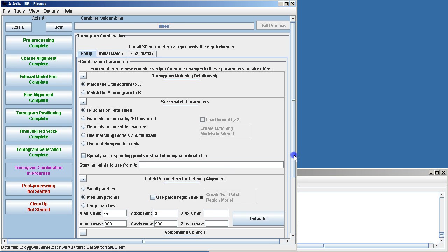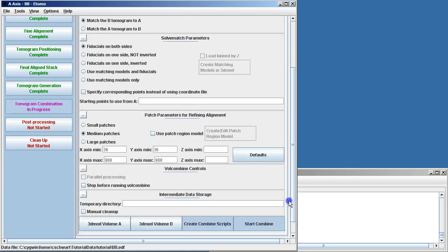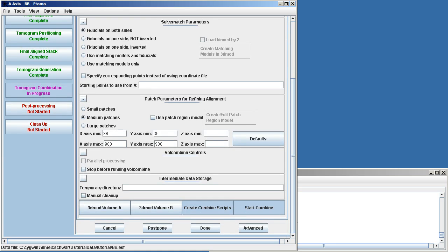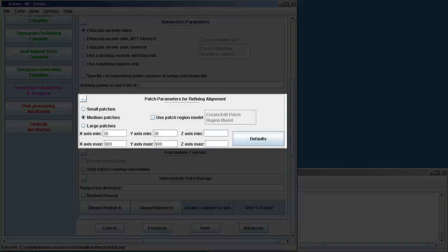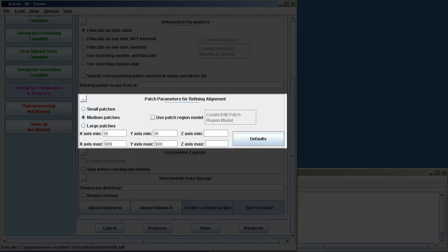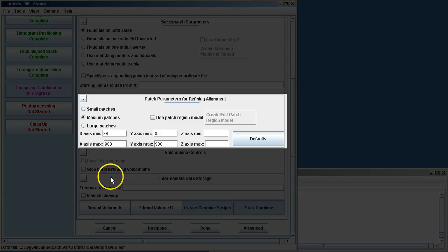Now we can move up to the bottom half of the page. Here, we want to use the default of medium patches, and there's a buffer built in for the X and Y min and max edges of the tomogram. But the Z-axis, we need to choose ourselves.